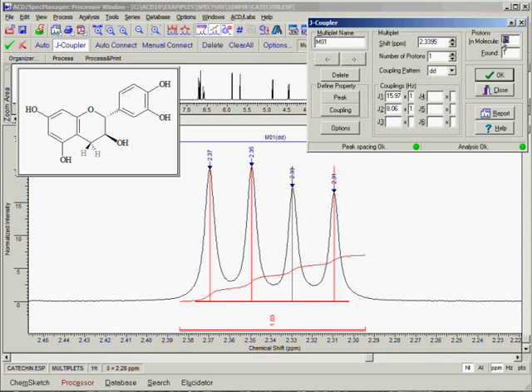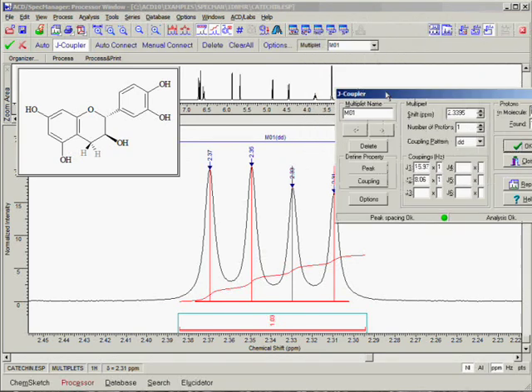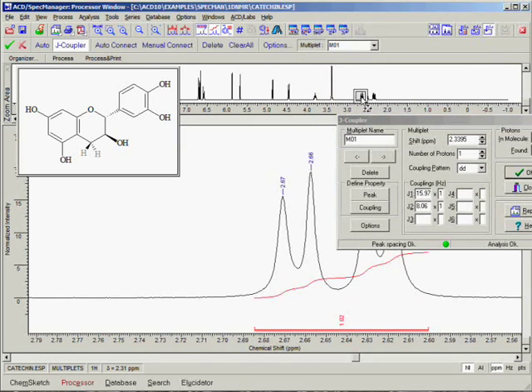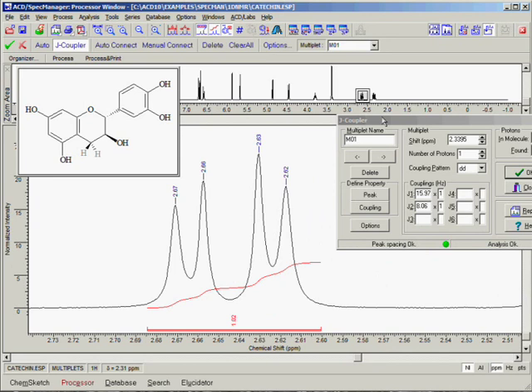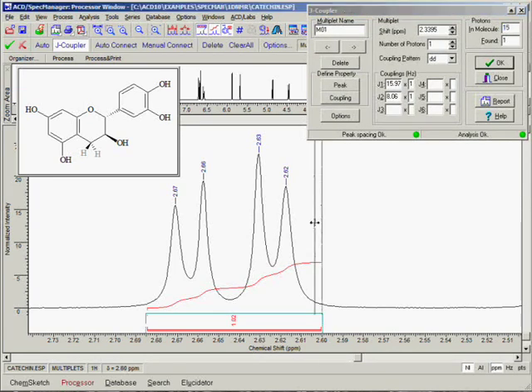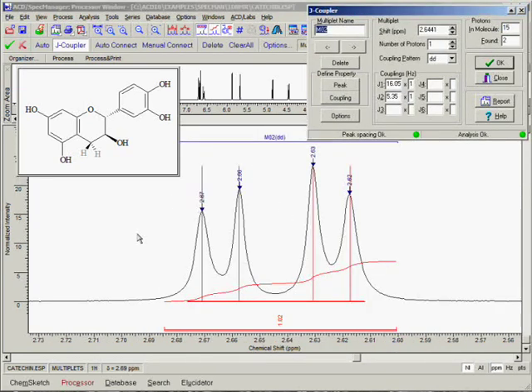To proceed to the next multiplet, we can use the scroll bar on the bottom of the spectrum display area or the zoom window. Now create a multiplet in the same way: hold down the left mouse button and drag across the region of interest, then release and the multiplet is created. You can see that the same information produced for the first multiplet is now available for the second one — an automatic name, chemical shift, number of protons, coupling pattern, and coupling constants.